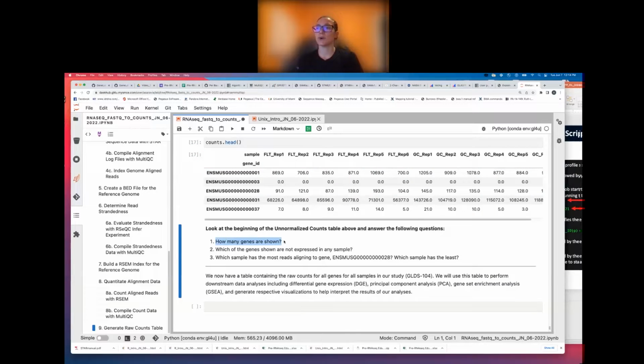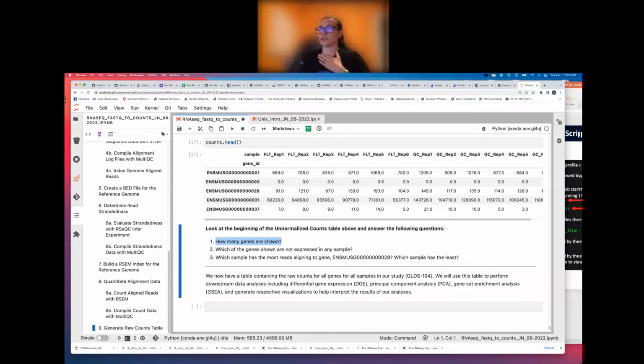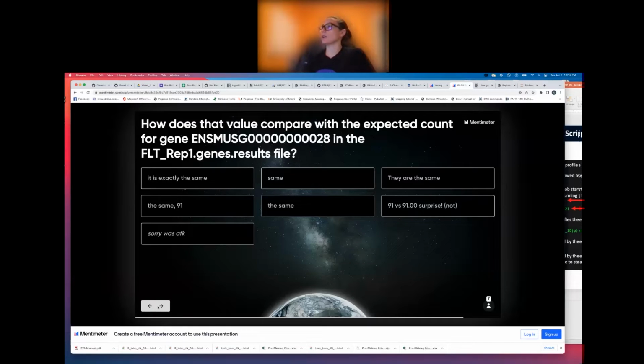Lisa, if you could pull up the how many genes are shown question. And maybe let's put the link in the chat again. I think I still have that link up here. Oh, thanks, Lisa. So yeah, go to the Mentimeter link and you should see the question, how many genes are shown. We'll give you a few seconds to count the number of genes that you are seeing in the head of our counts table here. I'm going to go ahead and view everyone's responses.